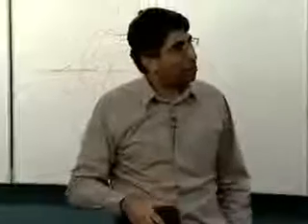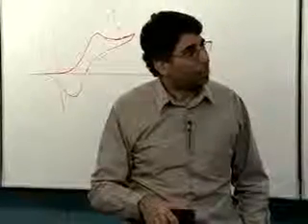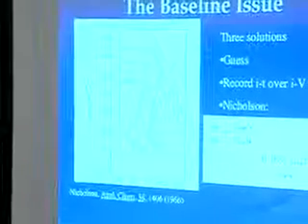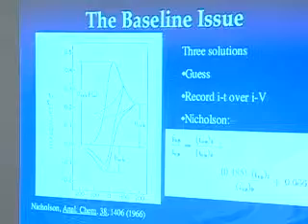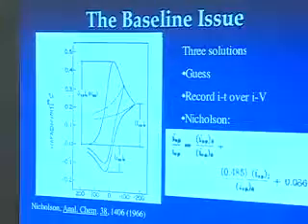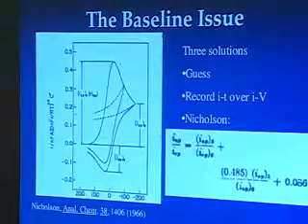And again, Nicholson and Shain say you should do all of them. But obviously, if all I need is this peak right here, that's easy to get. So if I do the current function just for the first peak, no problem. If I do the peak-to-peak separation, this is unaffected. But you can't get all your results that way, unfortunately.